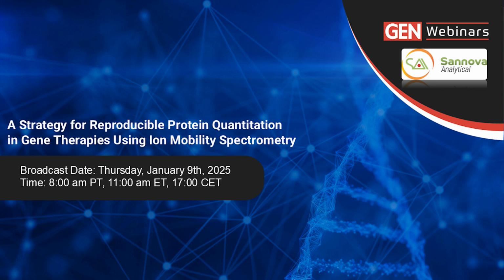So what are some of the key takeaways from today's webinar? Well, you'll learn how the technology can resolve isomer differentiation and low abundance protein challenges. You'll hear how it can increase confidence in target protein expression quantification results. And you'll hear about an accelerated and scalable strategy for gene therapy development.